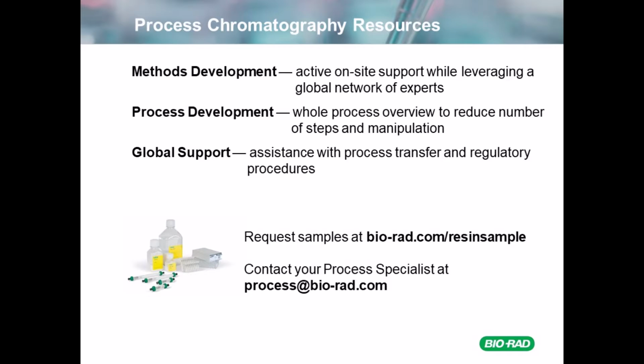However, doing a DOE with 18 samples like that, there is a cost associated with it. So I think in the situation that maybe it's a brand new process, you have no historical use of, say, a resin and how it's going to react, I think it would definitely be good to do a preliminary study.